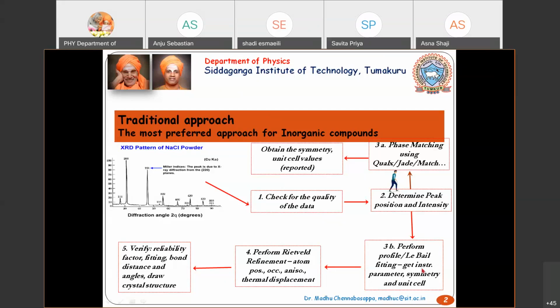So I'm just showing this because we started from here. You can take your lab X-ray, synchrotron or neutron data. From data collection, what we did is we reached this Le Bail fitting. So this is where we are right now. Next, we have to give more information about your sample, like your chemical information, and then you can choose a model, or you can also do a reciprocal lattice, but we won't go more into this reciprocal lattice. We will choose a model, and then you can also know whether it is a single phase or multi phase.